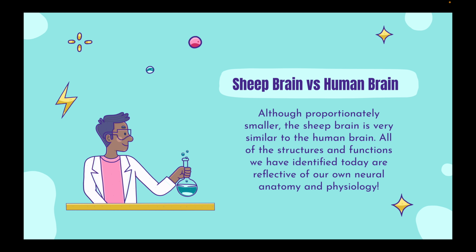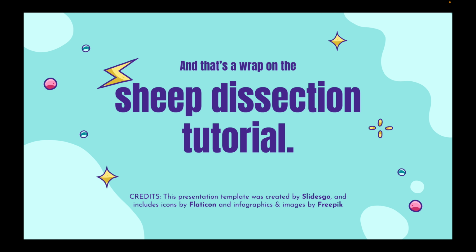to remember that the sheep brain is very similar to the human brain. Despite being proportionately smaller, all the structures and functions we have identified today are reflective of our own neural anatomy and physiology. And that's a wrap on the sheep dissection tutorial.